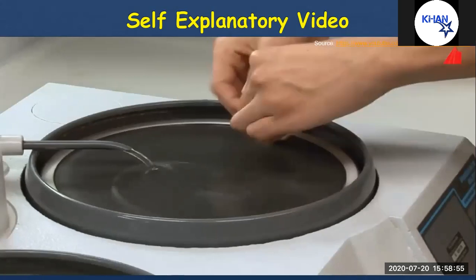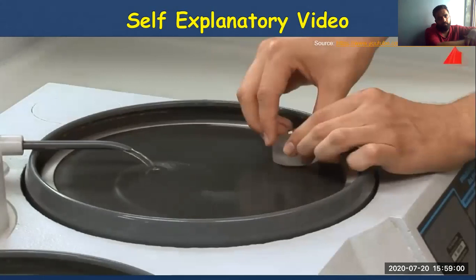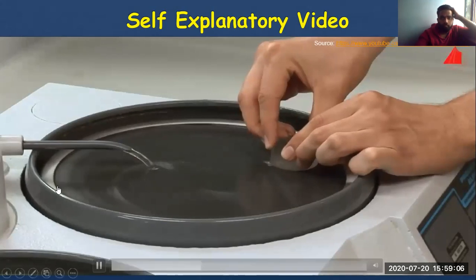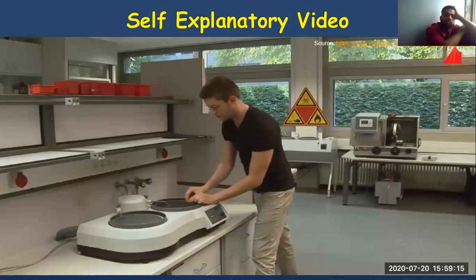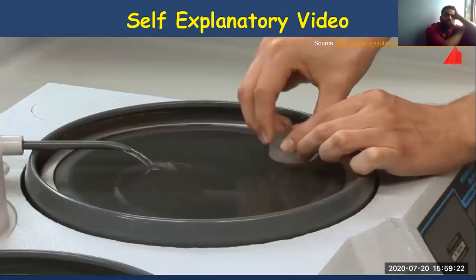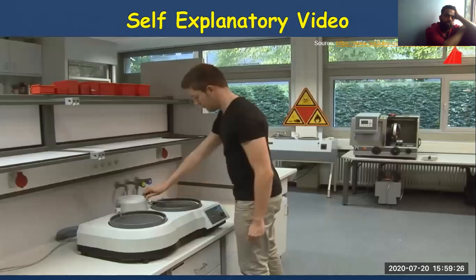Yes, sir. The preparation of the intended plane of examination. Our material tester begins with comparatively coarse 180 grit abrasive paper. He makes sure to press the specimen calmly and evenly onto the abrasive paper, compensating the tendency for the sample to tilt. He also makes sure not to grind his fingertips accidentally. Now he has achieved an even, relatively rough surface. The specimen is ready for the next step with finer paper.